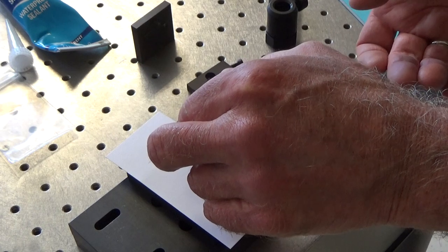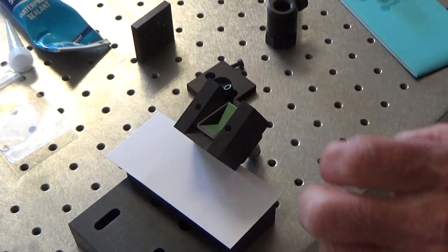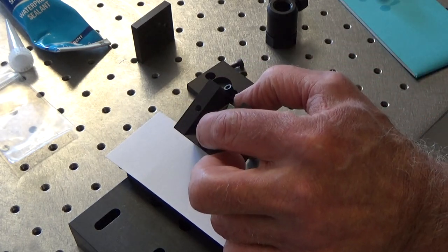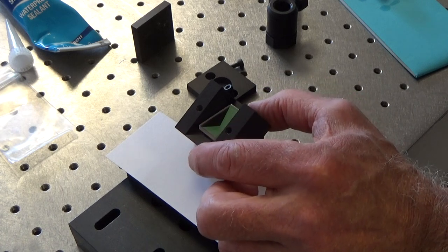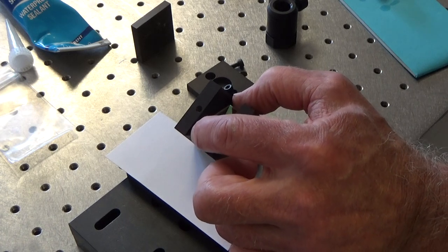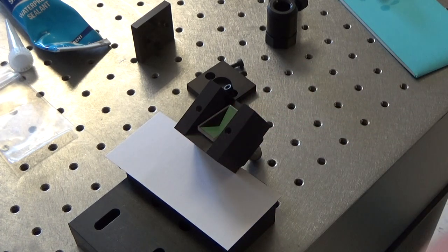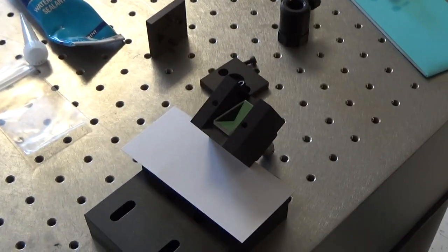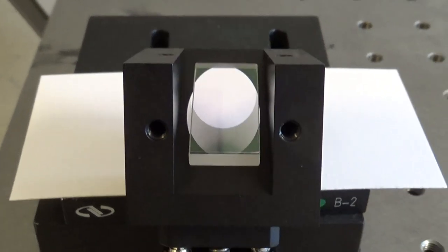And then position it so that it is filling the circular aperture. I'll just show you with the white card behind it.